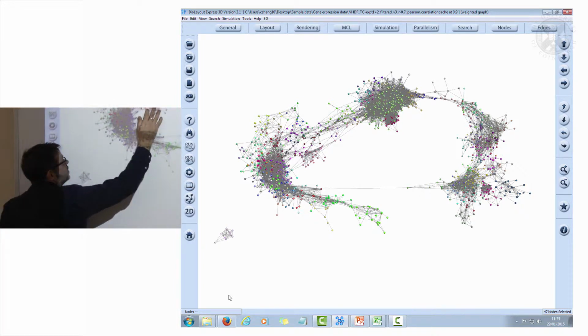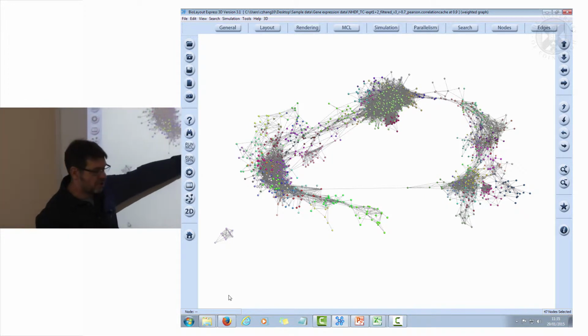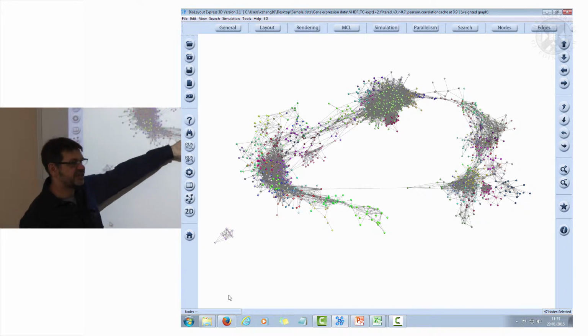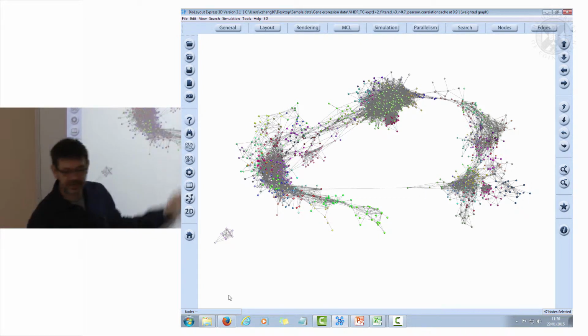So here, this continuum shows this here. There's a decrease and then a burst here. So actually understanding that structure is quite important. And most time course data, when Claire gets to look at her data, she'll see a cigar shape of LPS response, and that will represent it from the early to the late.